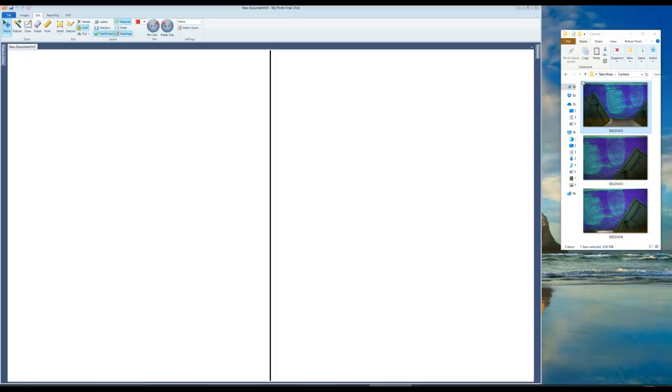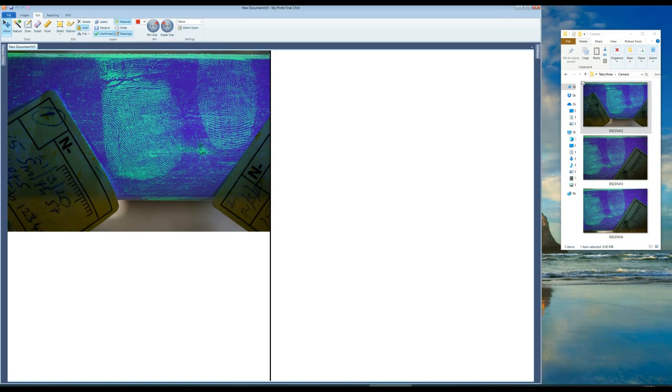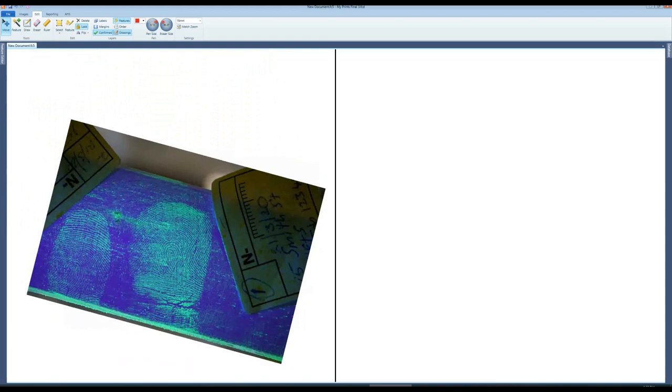Open the fingerprint comparison software and then load images by the drag and drop method. Left click the mouse to position the image. Right click to rotate. Scroll to zoom in.